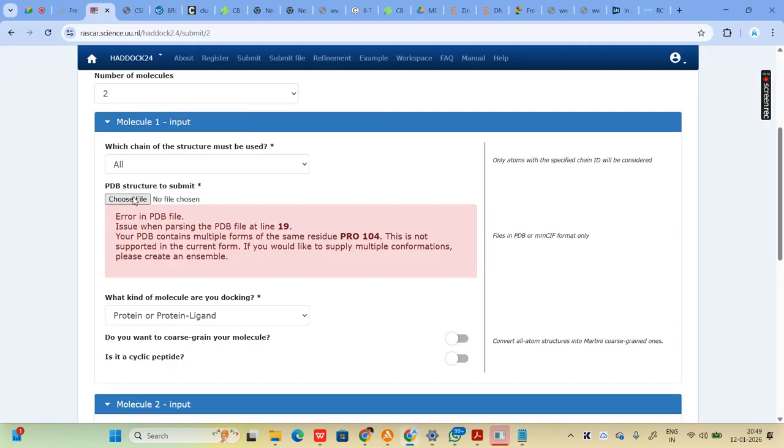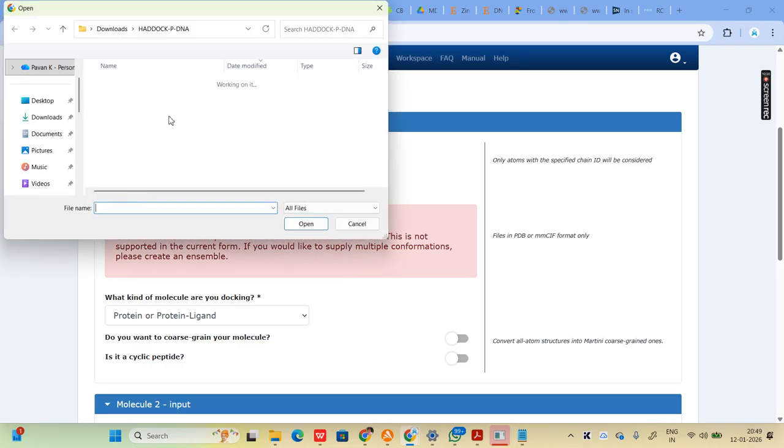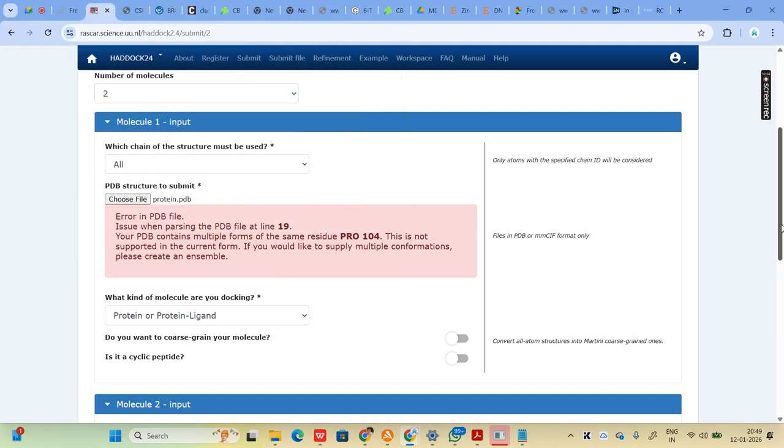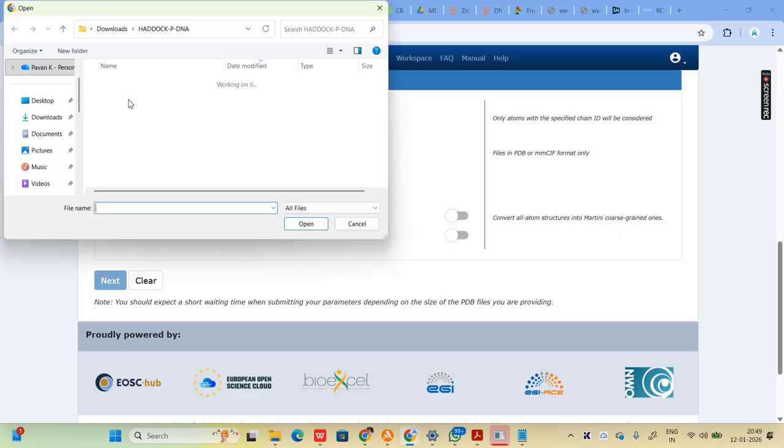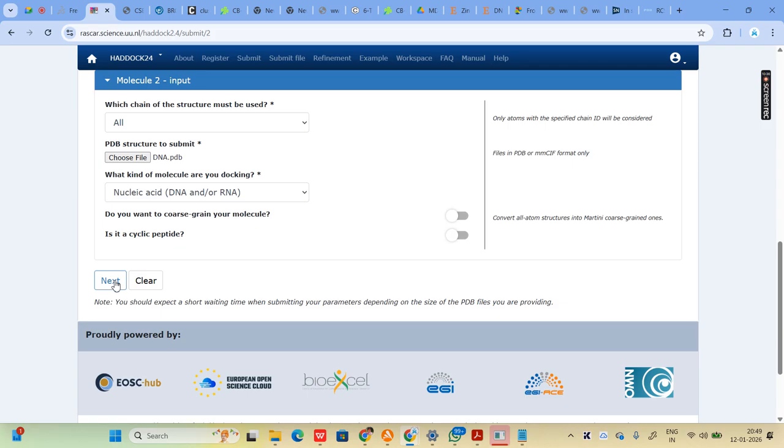Now let's upload again. We have the protein and the DNA. Okay, so then click on next.